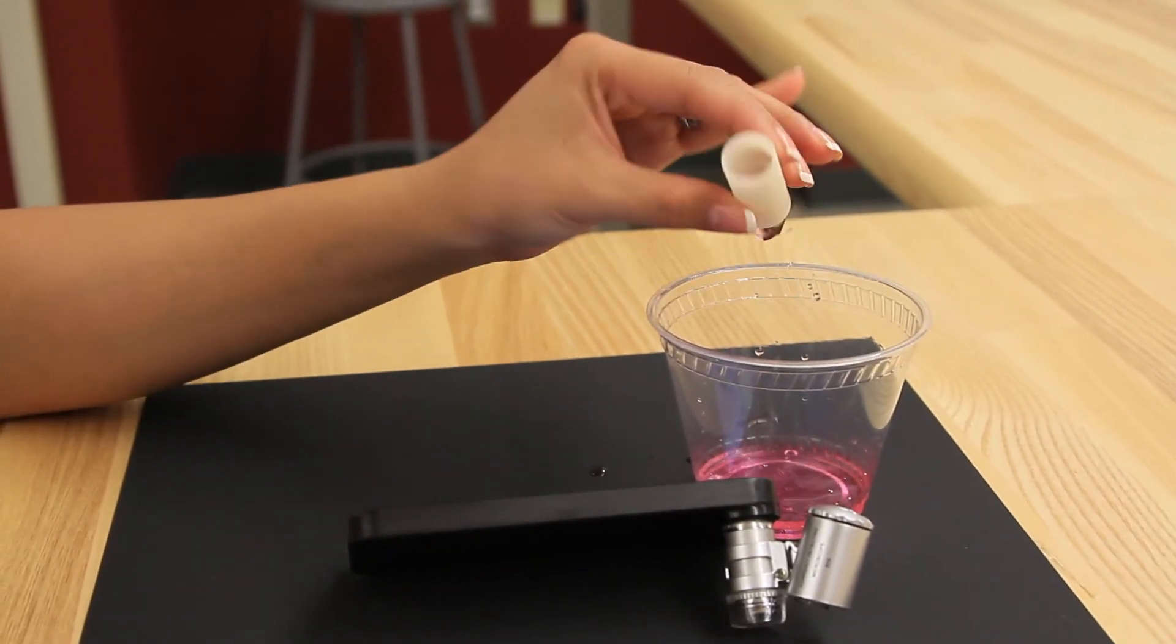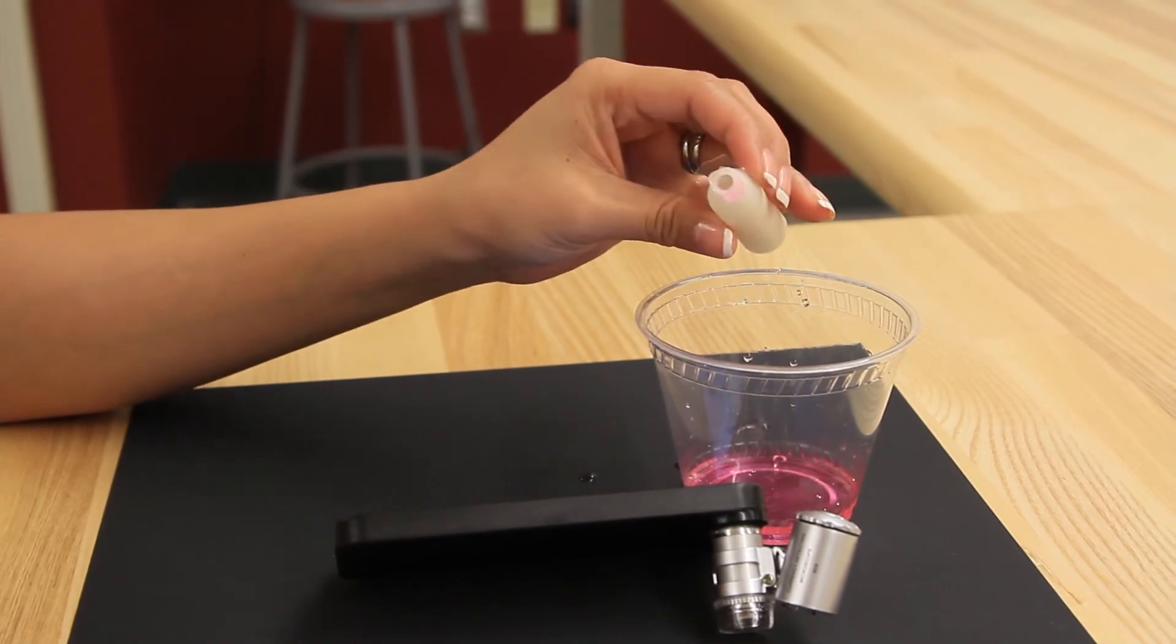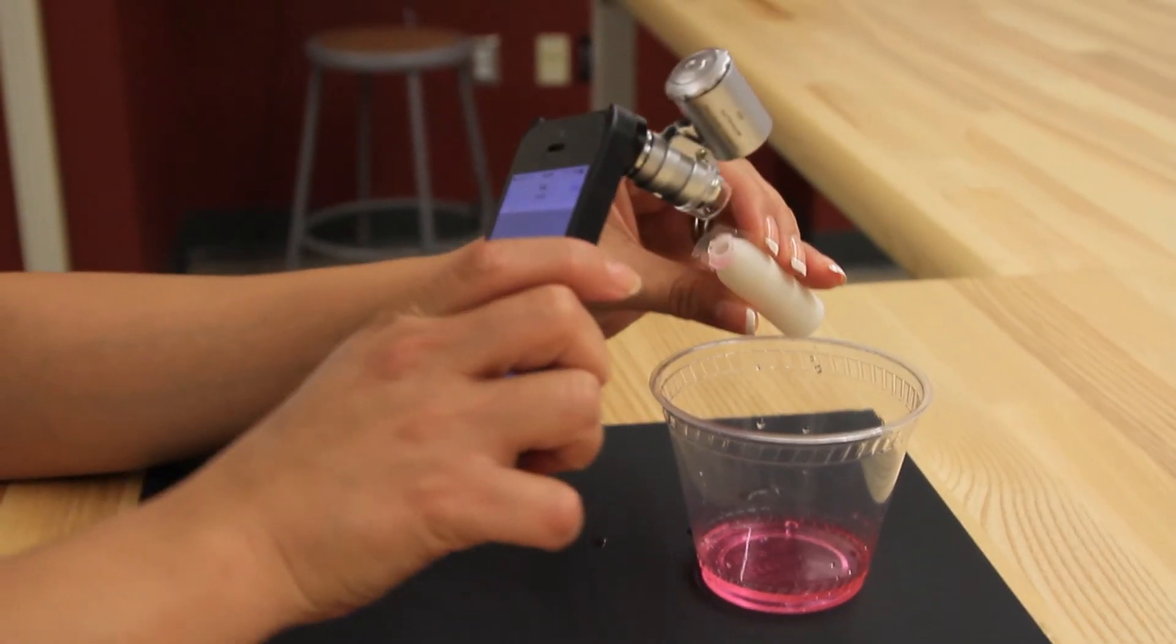Using an affordable and commercially available camera-phone microscope attachment, magnetically labeled cells can readily be enumerated.